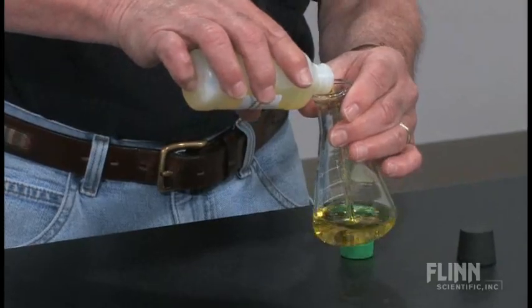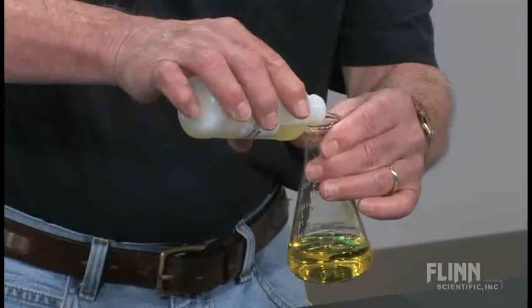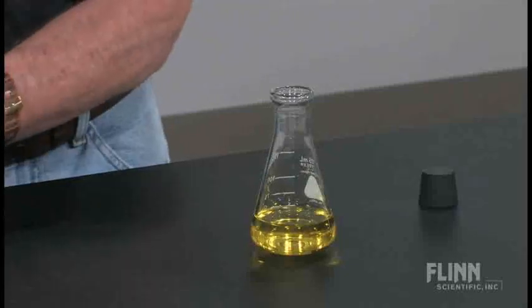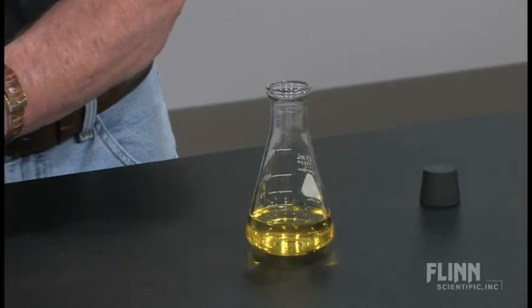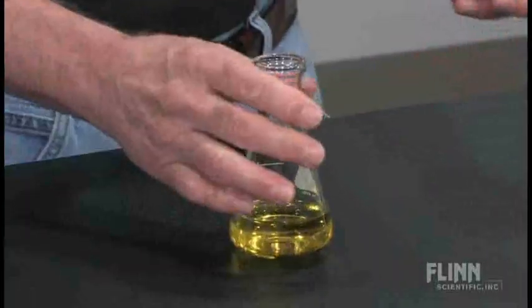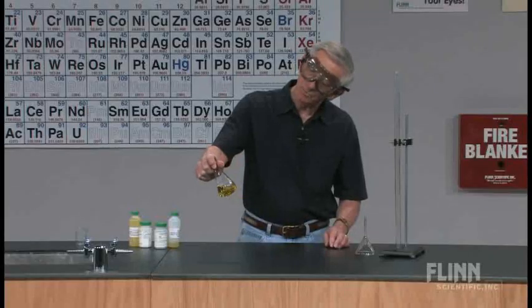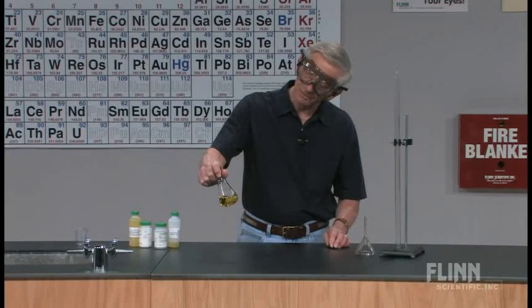In an acidic solution, vanadium 5 is present in the form of the ammonium metavanidate compound, the metavanidate ion. It's a bright yellow color, very pretty.